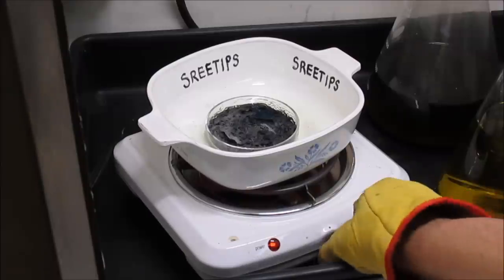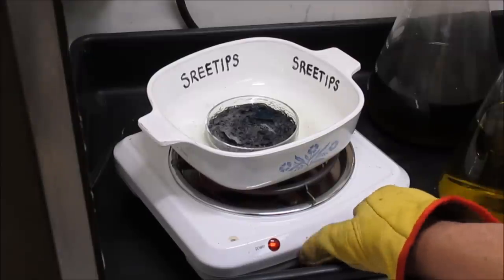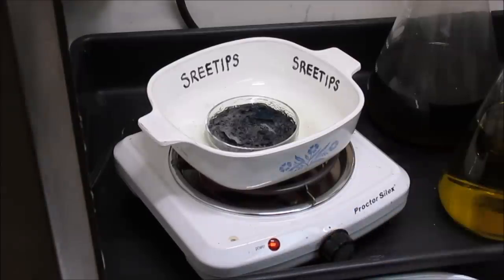I'm going to turn the heat off now and let our palladium sponge cool down. Then I'm going to get it out of that fused quartz dish, put it in a melt dish, and melt it up into a button.